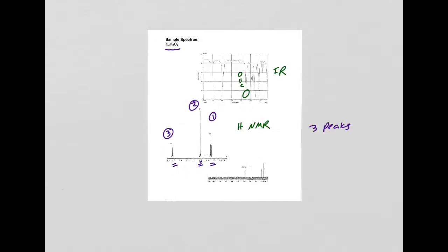All right, so we know the chemical shifts, and these numbers are the integration. Now let's go over what integration means. So here is the deal with integration. The area under an NMR peak, the area under an NMR signal is proportional to the number of absorbing protons.